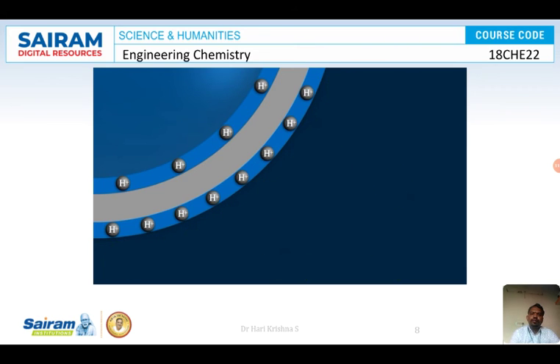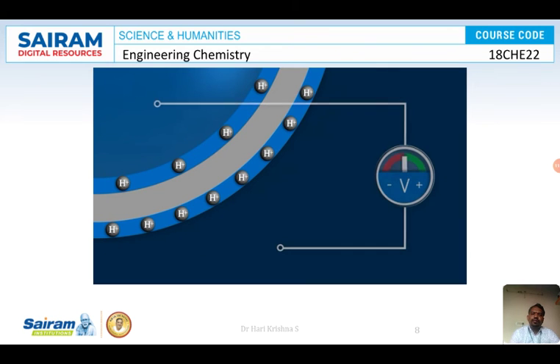If the hydrogen ion concentration, hence the pH value, on the inside differs from the concentration on the outside, a measurable potential difference forms. If the hydrogen ion concentration on the inside is lower than on the outside, as shown here, the measured solution is acidic with a pH value lower than 7. If the hydrogen ion concentration is identical on both sides, no potential difference forms and the measured solution is neutral with a pH value 7. The measured solution is basic if the hydrogen ion concentration inside the glass bulb is higher than in the measured solution.